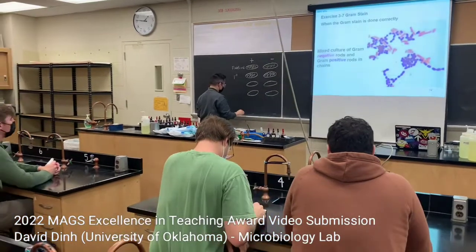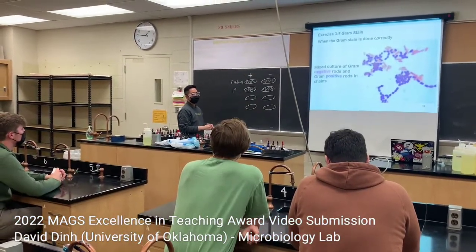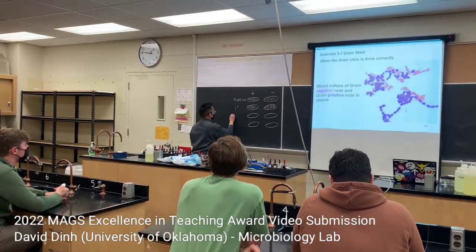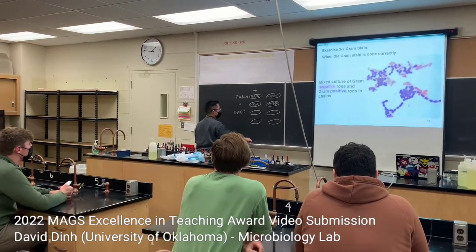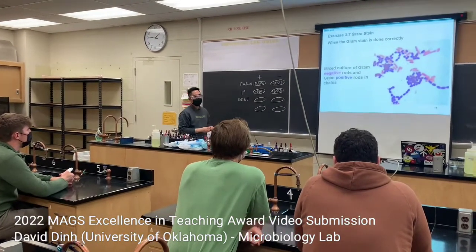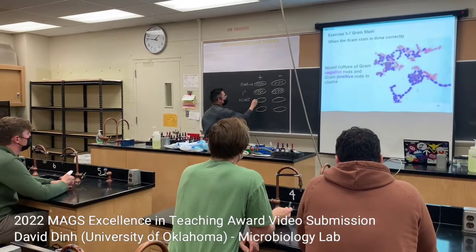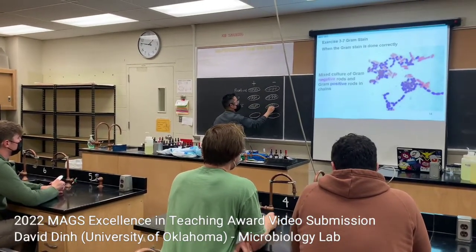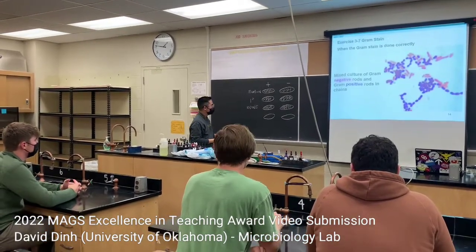Okay, what's the next step for this? You have the mordant, the iodine. Yes, the iodine. And what will be the color for both organisms? The gram-positive would be purple, and the gram-negative will be purple as well. Yeah, because we're just creating those crystal violet and iodine complexes.